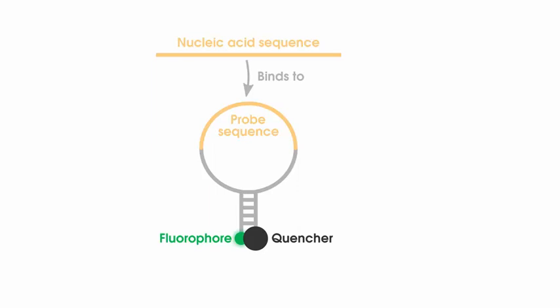So in this type of methodology, during the denaturation step and the annealing is when you have the probe being able to bind to the DNA, and then when it's double-stranded, when it's finished replication, then you have it not fluorescing at all.